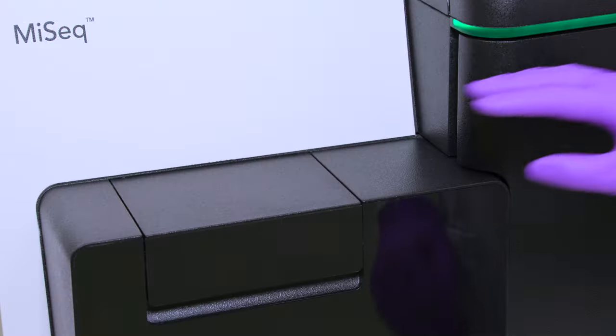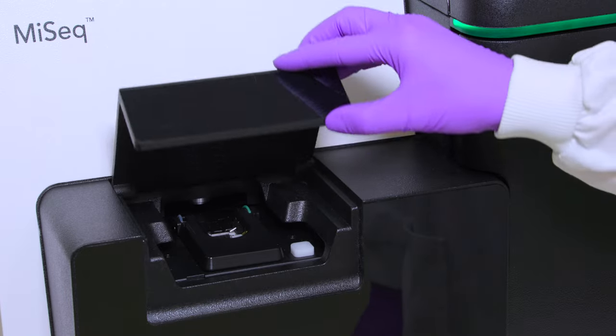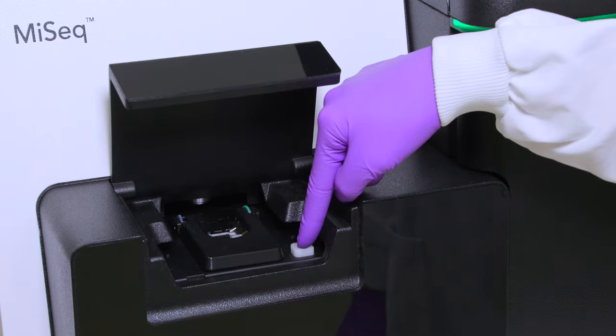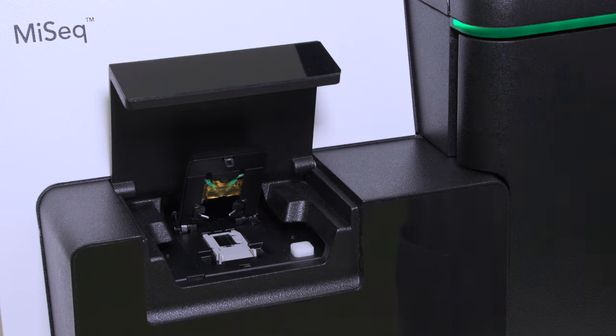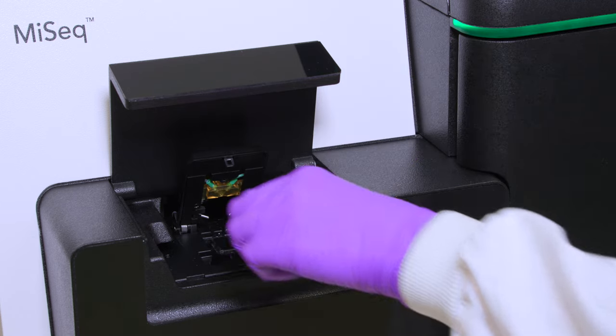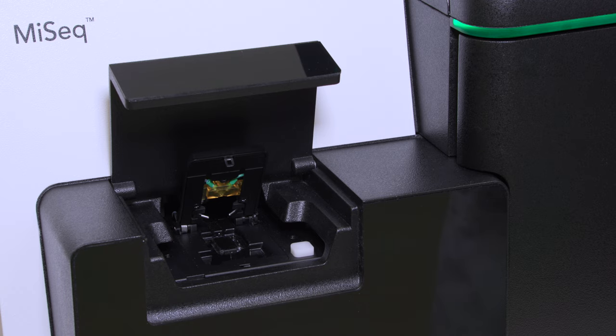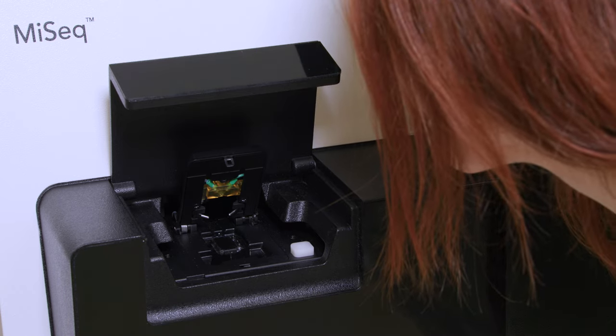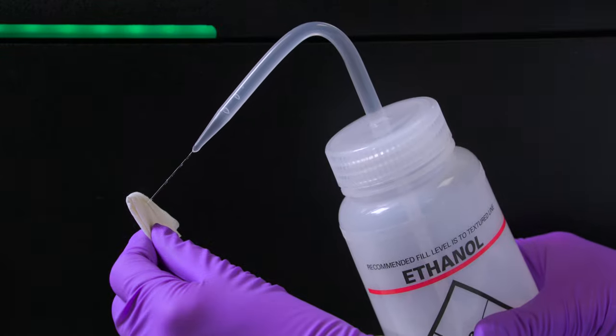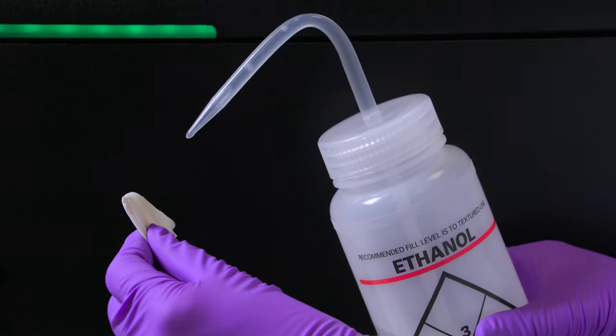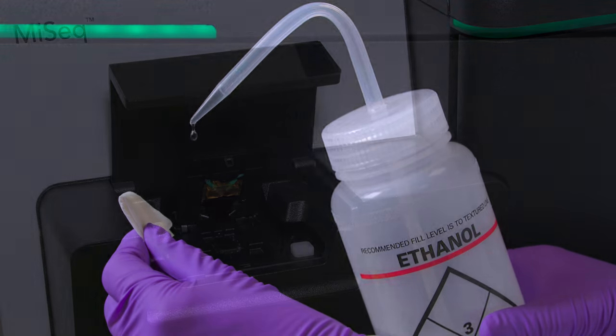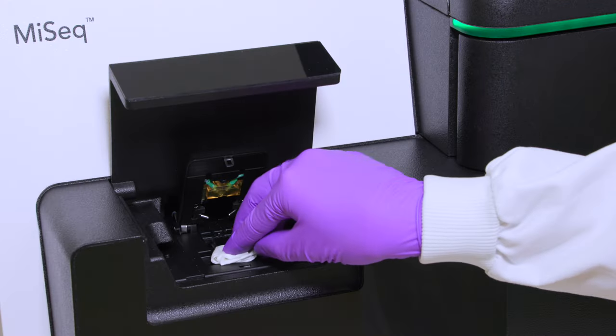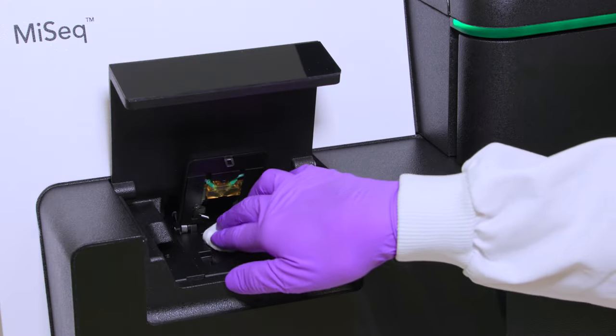Raise the flow cell compartment door and then press the release button to the right of the flow cell clamp. Remove the previously used flow cell. Make sure that the flow cell stage is free of lint. If lint or other debris is present, clean the flow cell stage using an alcohol wipe or a lint-free tissue moistened with ethanol or isopropanol.